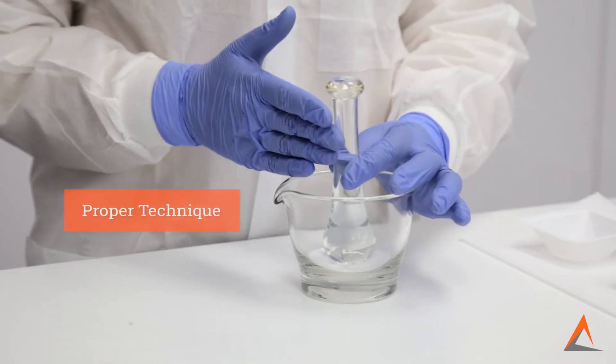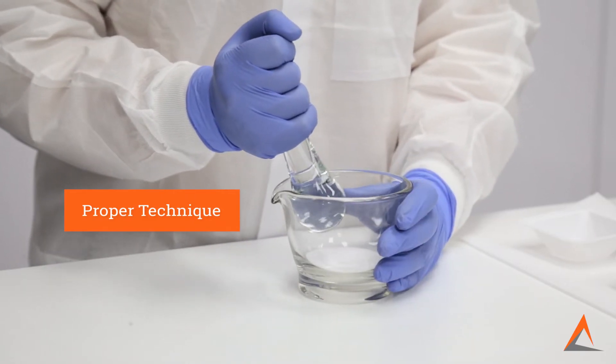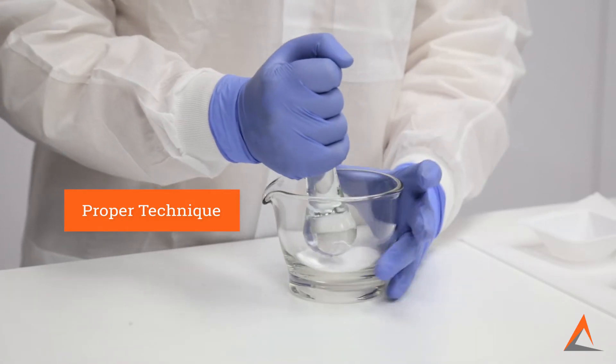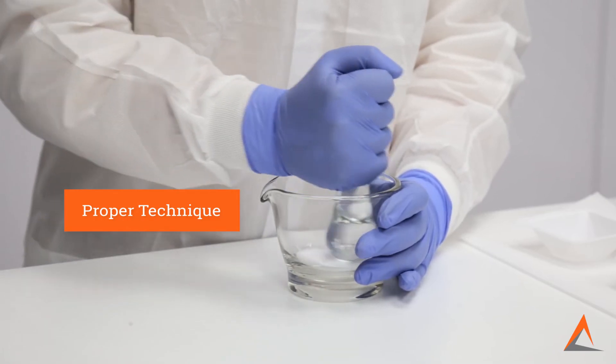Alternatively, to ensure that you are effectively triterating, you want to make sure you hold the pestle firmly in your hand and apply sufficient force against the sides and bottom of the mortar while stirring your powder. This will allow you to grind the powder between the mortar and pestle.